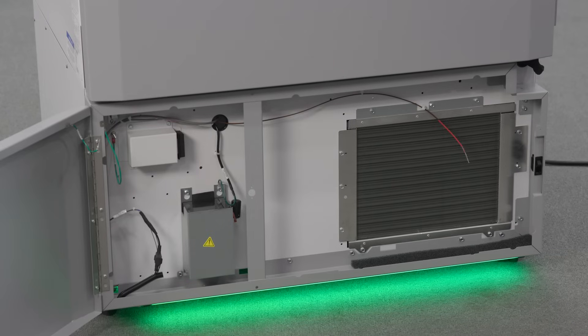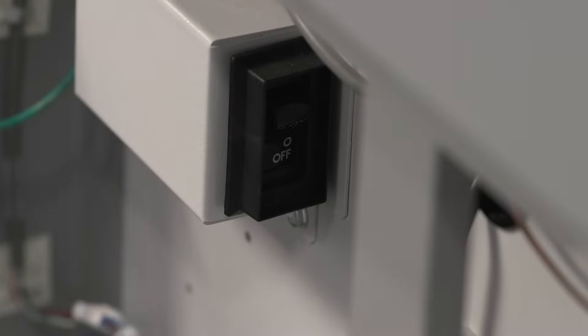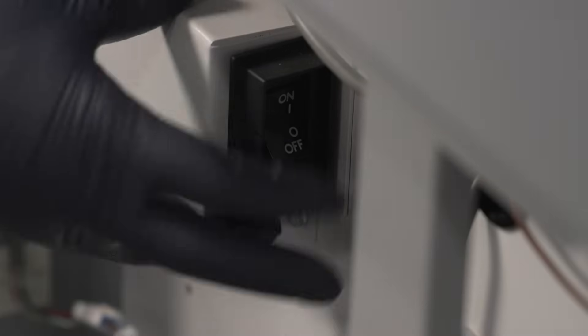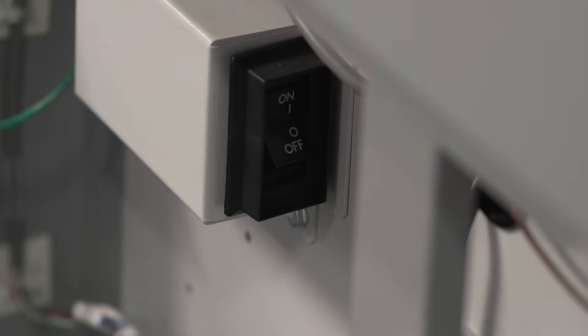The TSX Universal ULT Freezer's power switch is located behind the grill cover on the front of the unit. This location helps protect the freezer from being accidentally turned off.